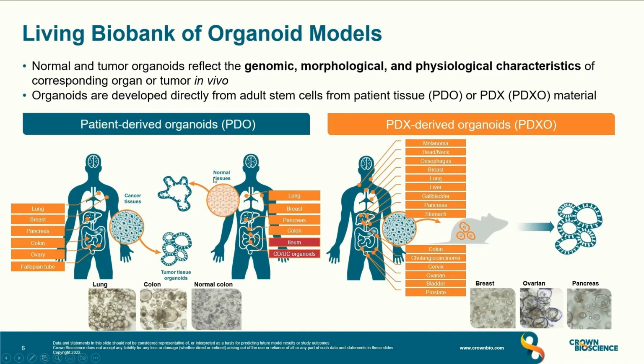In this case, we don't use the mouse models to expand the organoid models, which comes with the benefit of quick isolation and growth. But using these mouse models is also very beneficial, because the moment that the biopsy hits the mouse, it even better recapitulates the tumor of origin, and these isolated organoids are already well validated for in vivo use if you want to use the same organoid lines for in vivo follow-up.